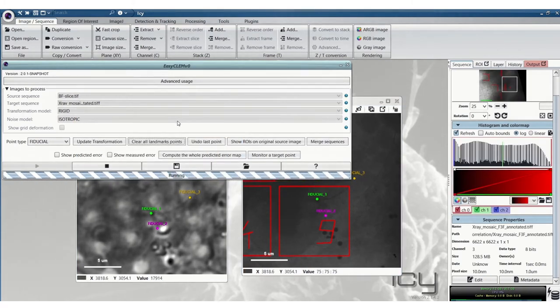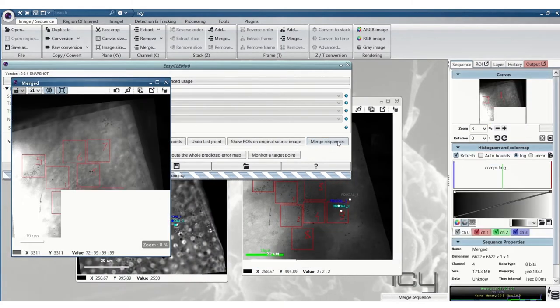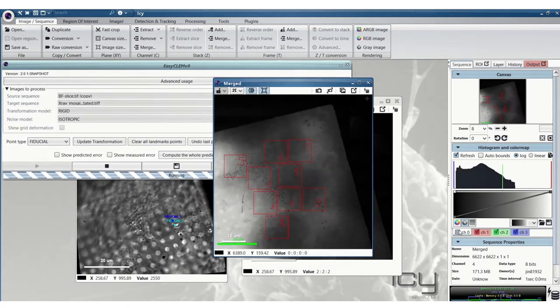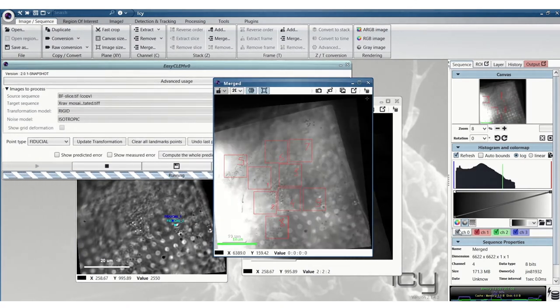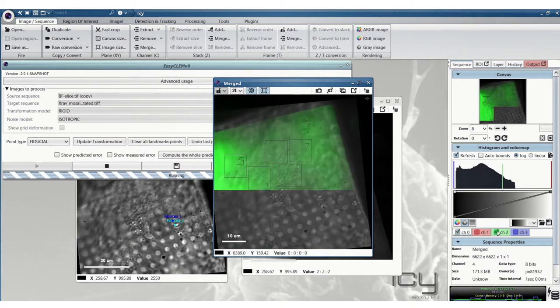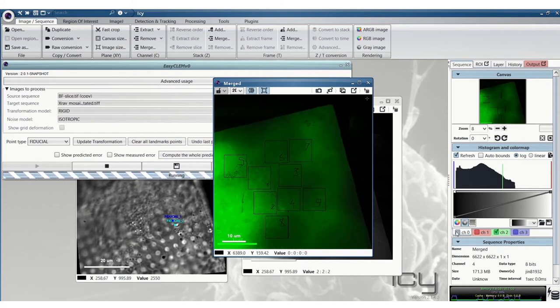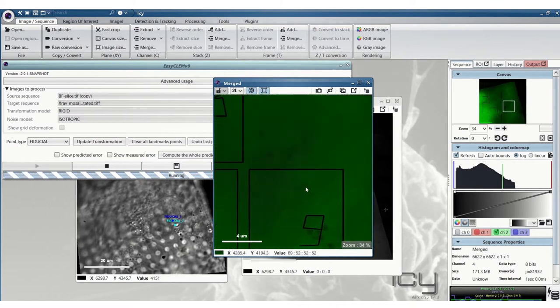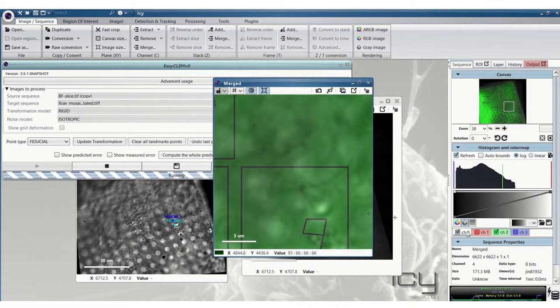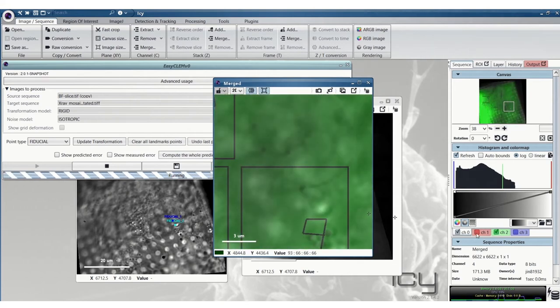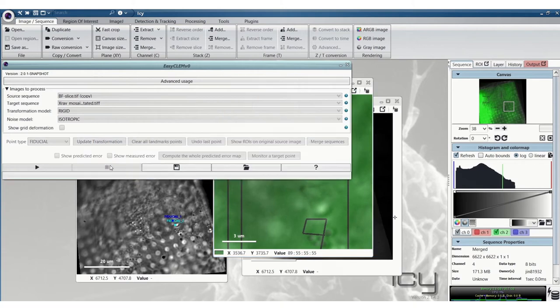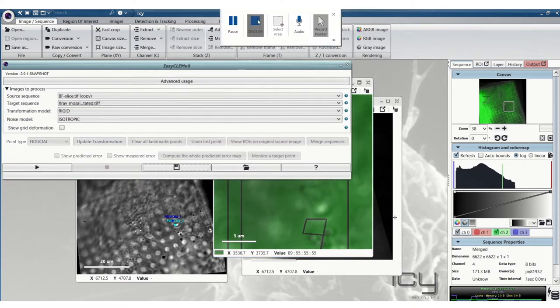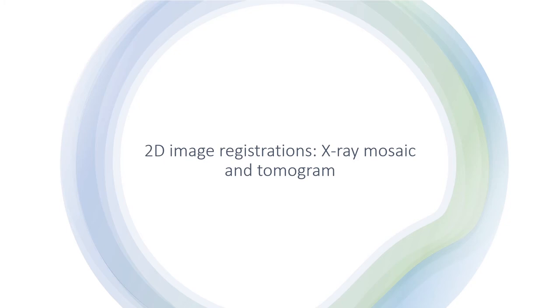So if that's not possible then you can do that but try to space them out if you can. Update transformation again and this will rewrite those XML files that were created in the folder already. You can just double check with the merge sequences. So that registration looks okay so now we'll stop that and we can go on to the next step.